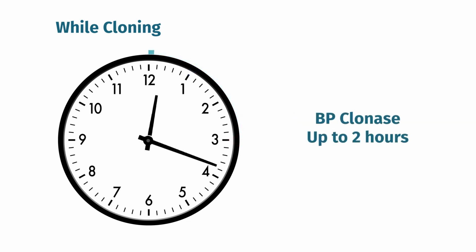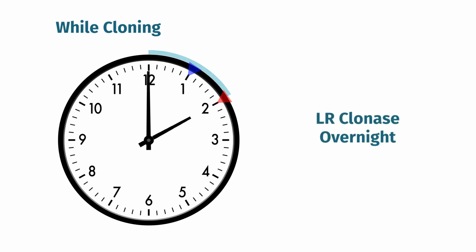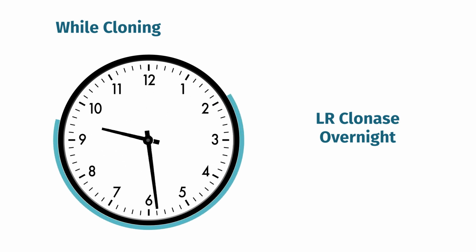1 hour is recommended for BP clonase incubation. However, if you are getting poor yields, consider extending the time. LR clonase takes longer, particularly if you are performing multi-site gateway cloning. You can allow these reactions to incubate overnight to improve cloning efficiency.